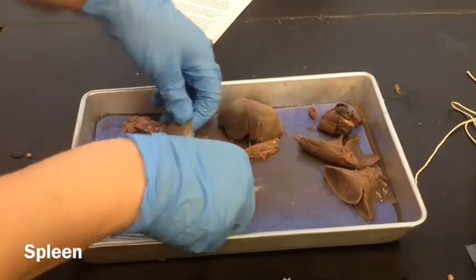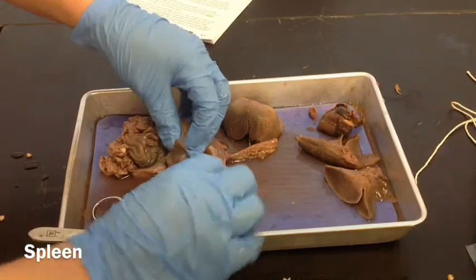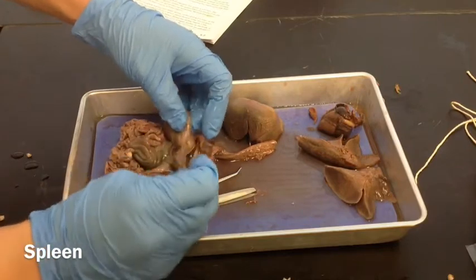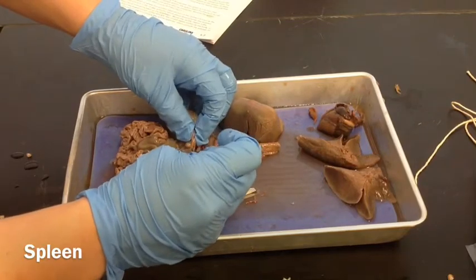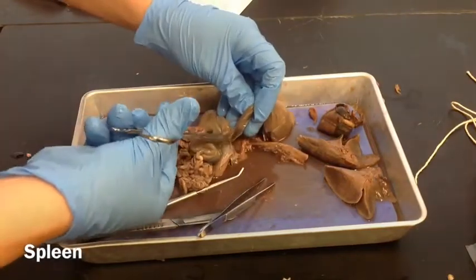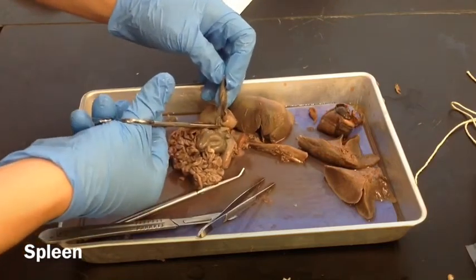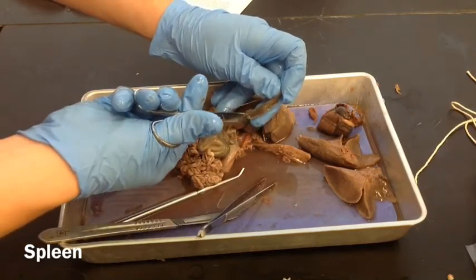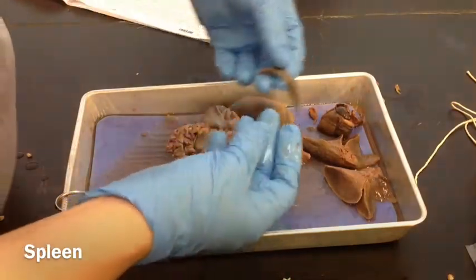Now we're going to remove the spleen. You really don't have to cut much — you just need to use your forceps to remove it. Just pull on it a little bit until you see that you have some attachments that you need to snip through. Be careful — this is the pancreas down here, so you don't want to cut the pancreas. It doesn't look like much, but it does some very important jobs. So this is the spleen — you're going to want to measure it and weigh it. You can set it aside when you're done.